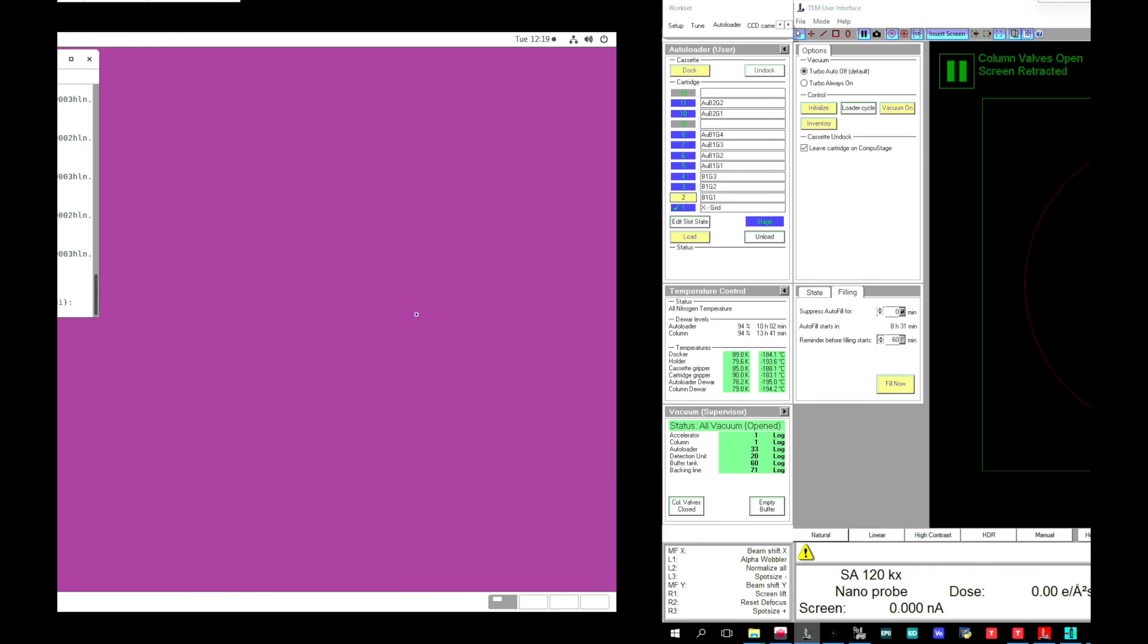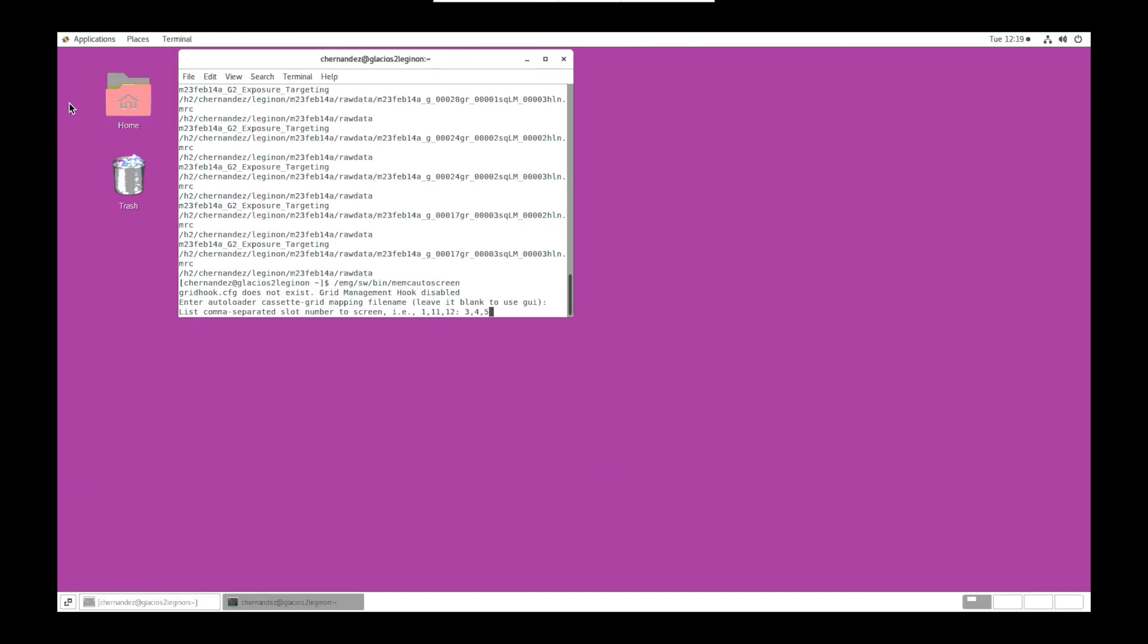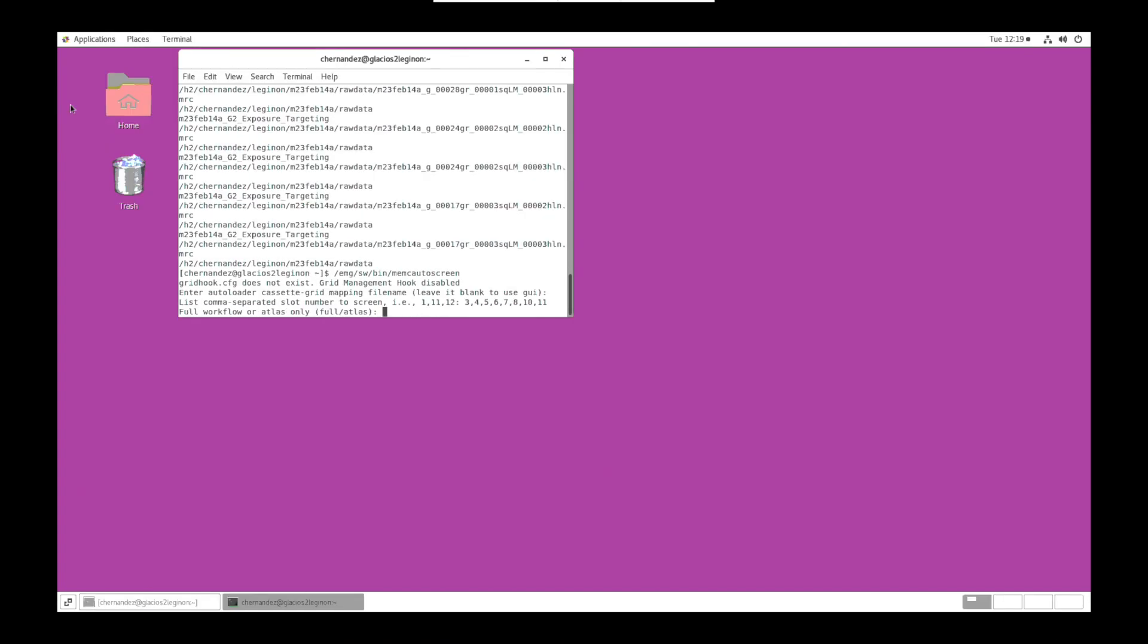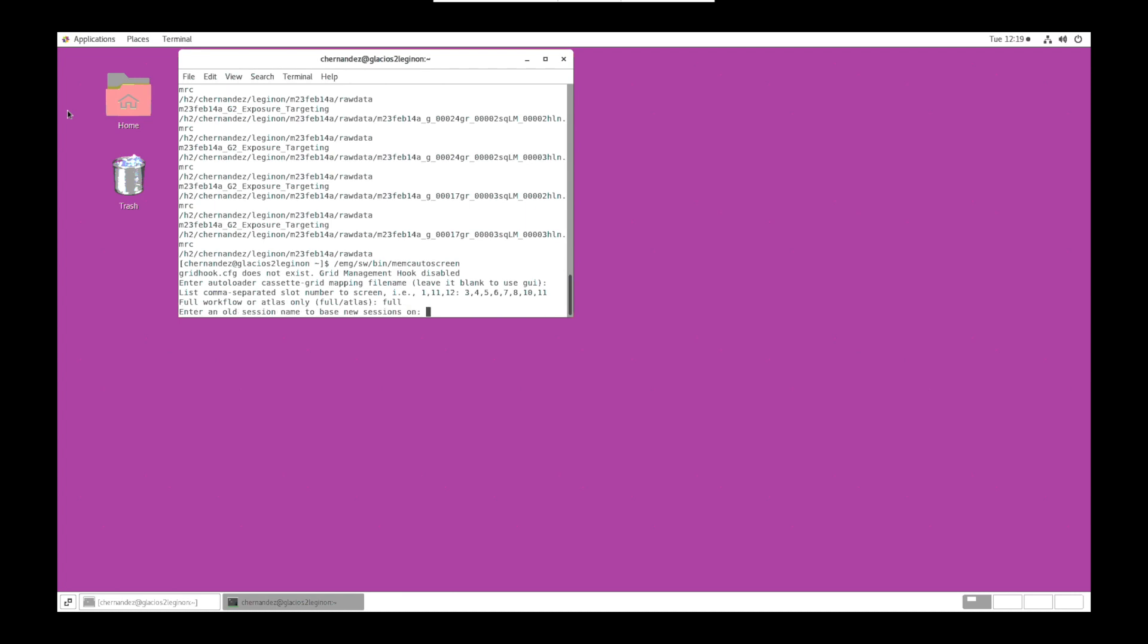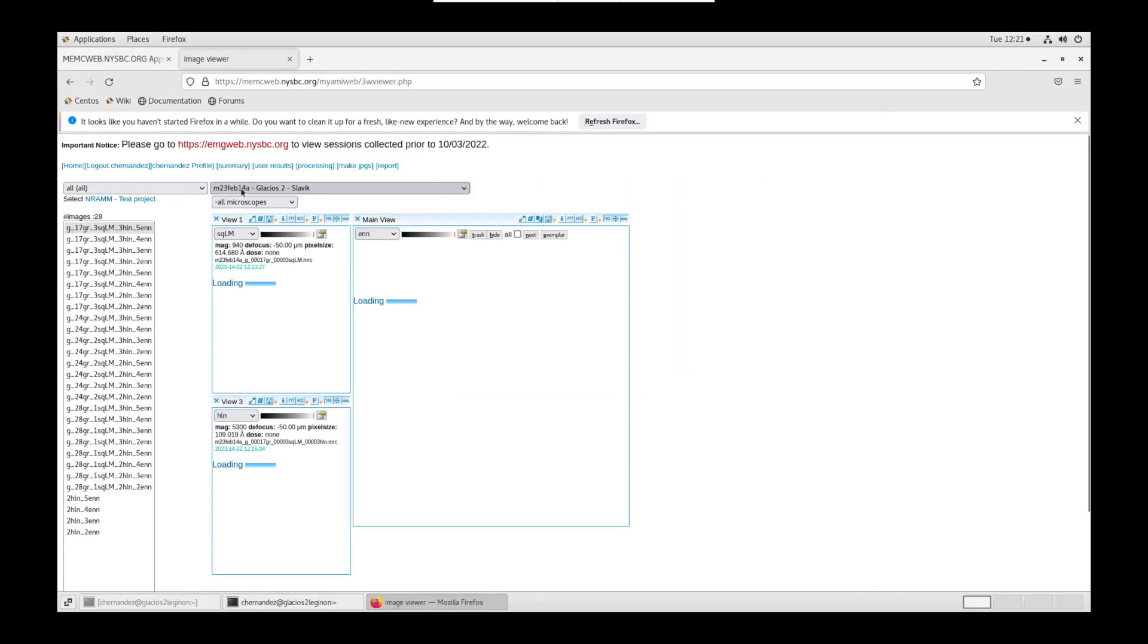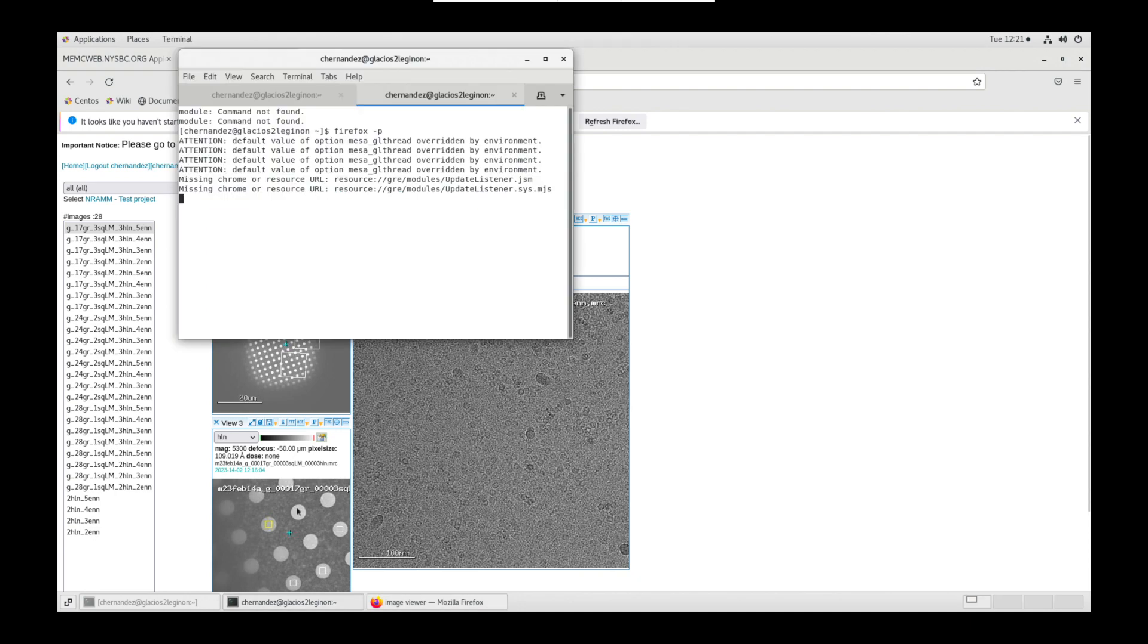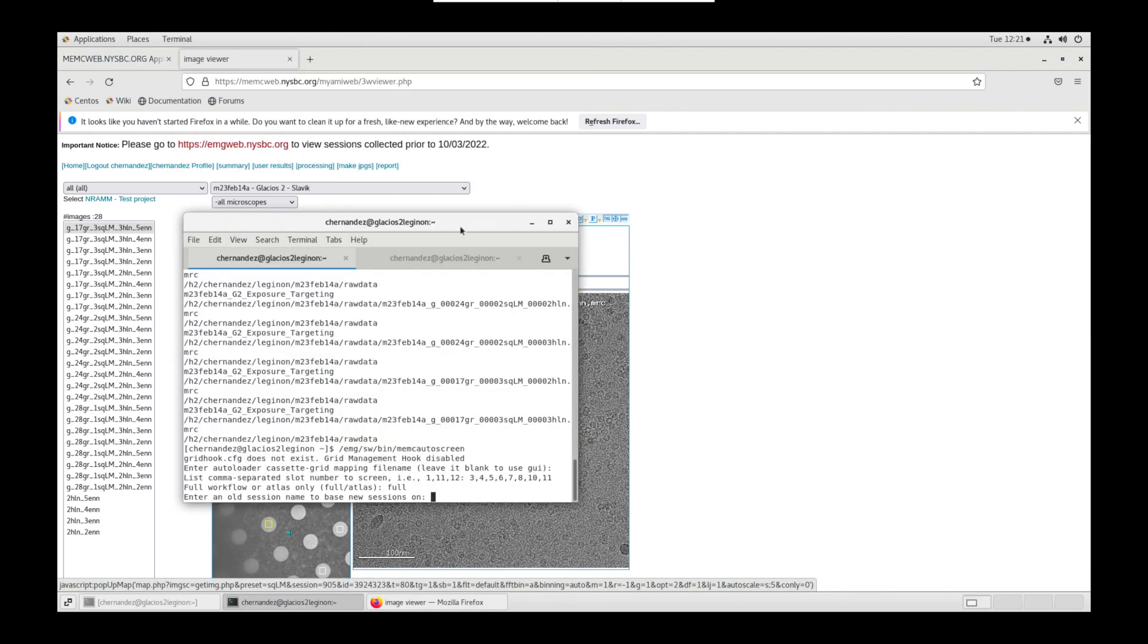Now list comma separated slot numbers to screen. You can verify on the microscope PC. Hit enter. Enter. We want the full workflow. Type full and hit enter. Enter an old session name to base new session on. This will be our template session name.